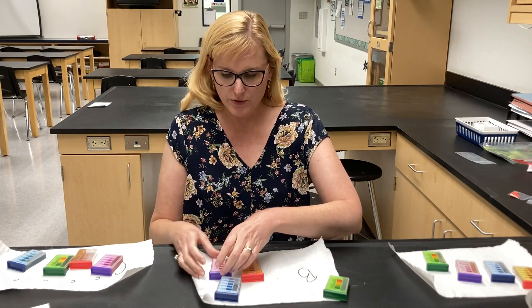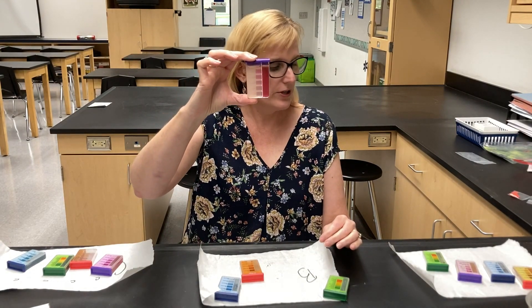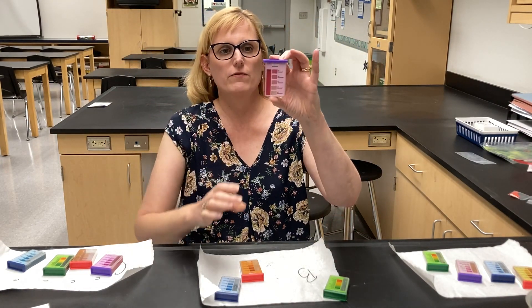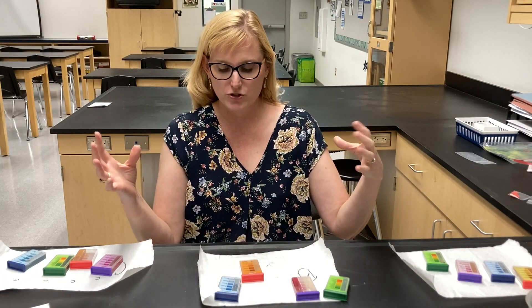Then let's go to nitrogen. Now this was very surprising, but maybe not so much. This is very, very dark and I would say that this is surplus — a very, very dark nitrogen reading. Surplus means extra, so there is a lot of nitrogen in this sample.